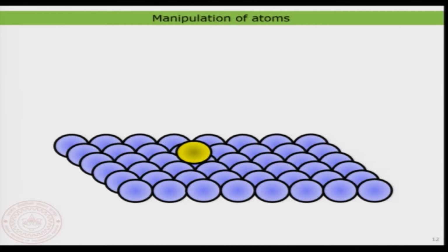called manipulation of atoms. This is a new perspective in surface science, and also a new perspective of scanning tunneling microscopy, because this is some capability of the scanning tunneling microscope that is not possible with any other microscope. So, that is the interesting thing. Because you have a probe, or something in your hand, with that you can move things, you can manipulate atoms on the surface.